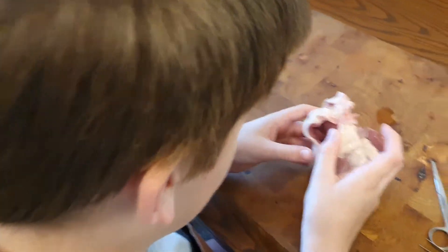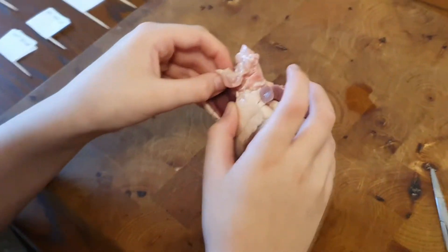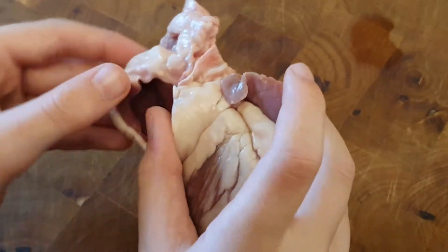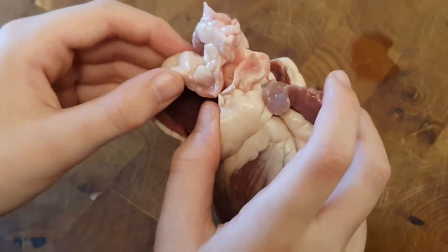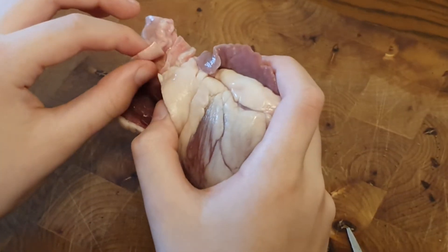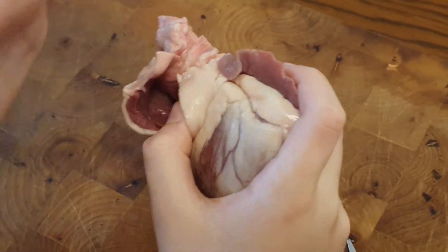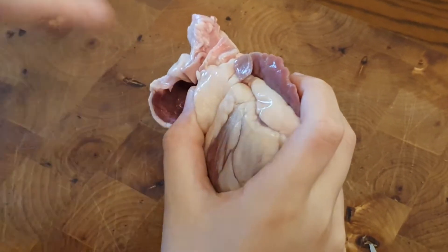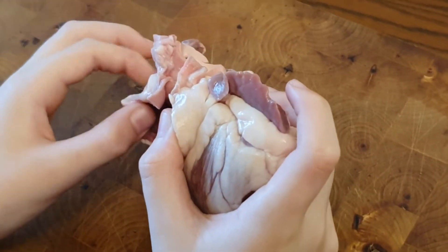There we go. So in here we have the first chamber of the heart. This is called the atrium — this is where the blood comes through and into the first chamber called the atrium.